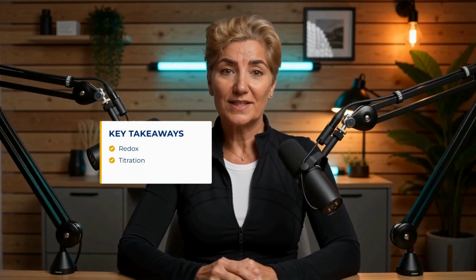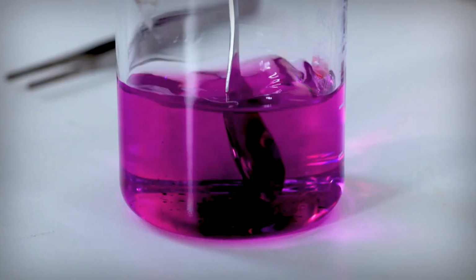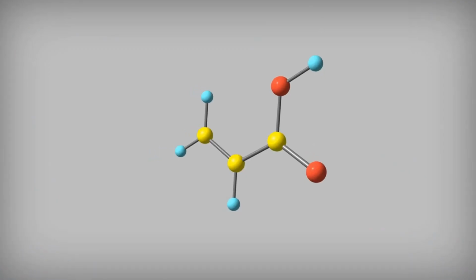In this experiment, you will investigate oxidation reduction chemistry while learning one of the most important analytical techniques. You will standardize a solution, determine an unknown, and observe how autocatalysis influences reaction rates. This experiment combines redox chemistry and stoichiometry into one powerful investigation. Let's begin.